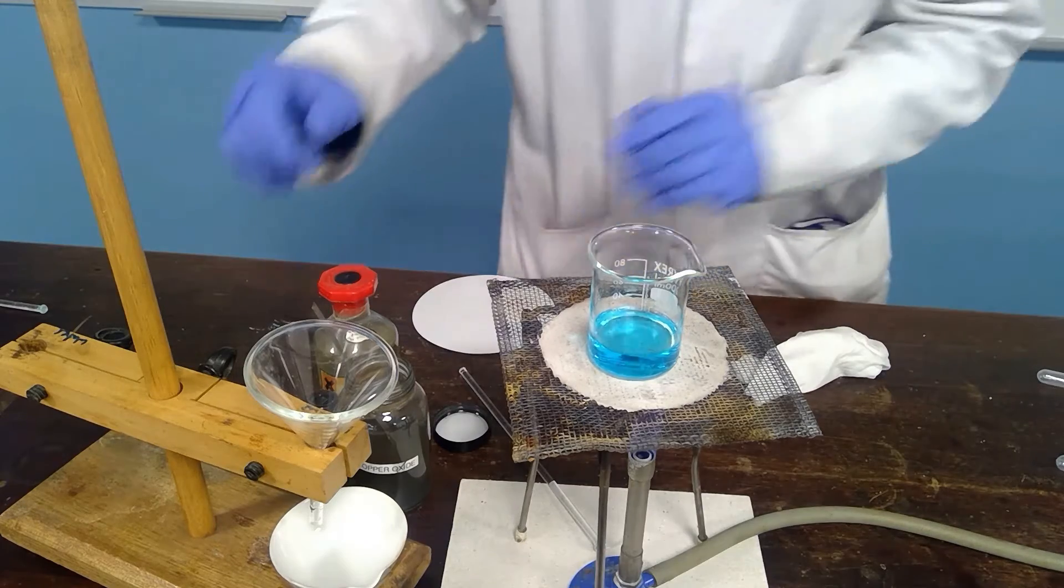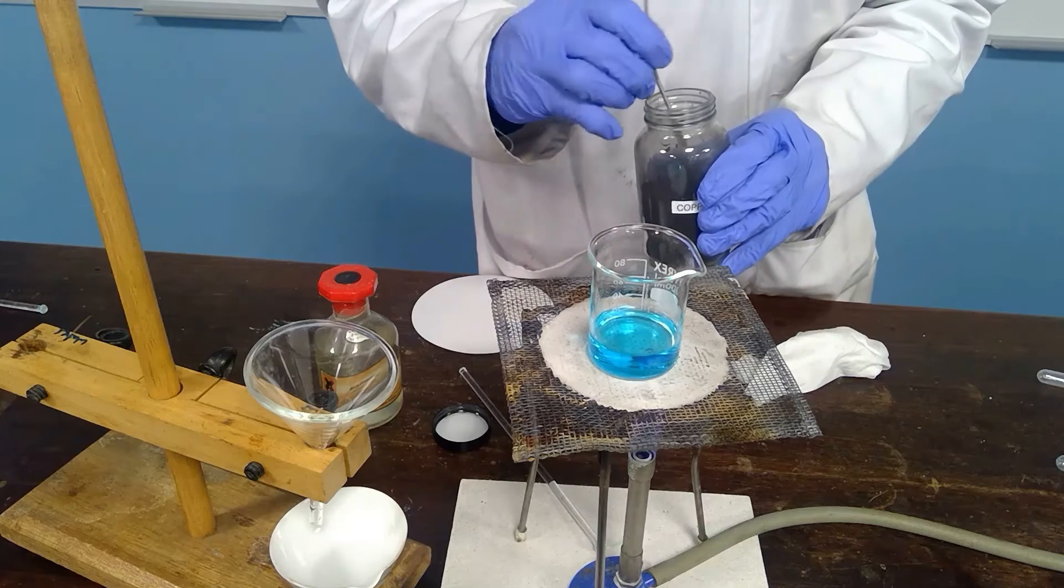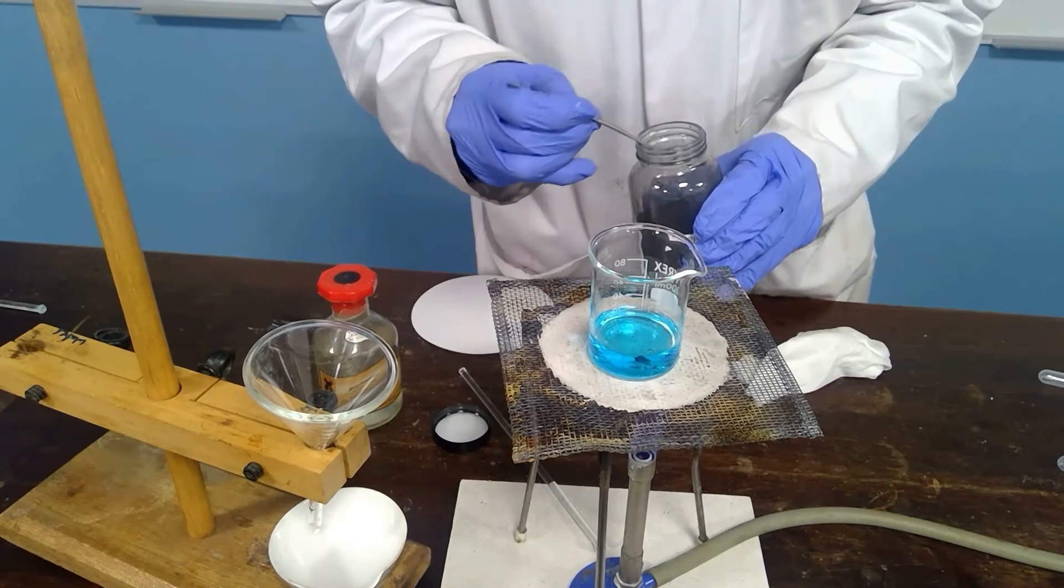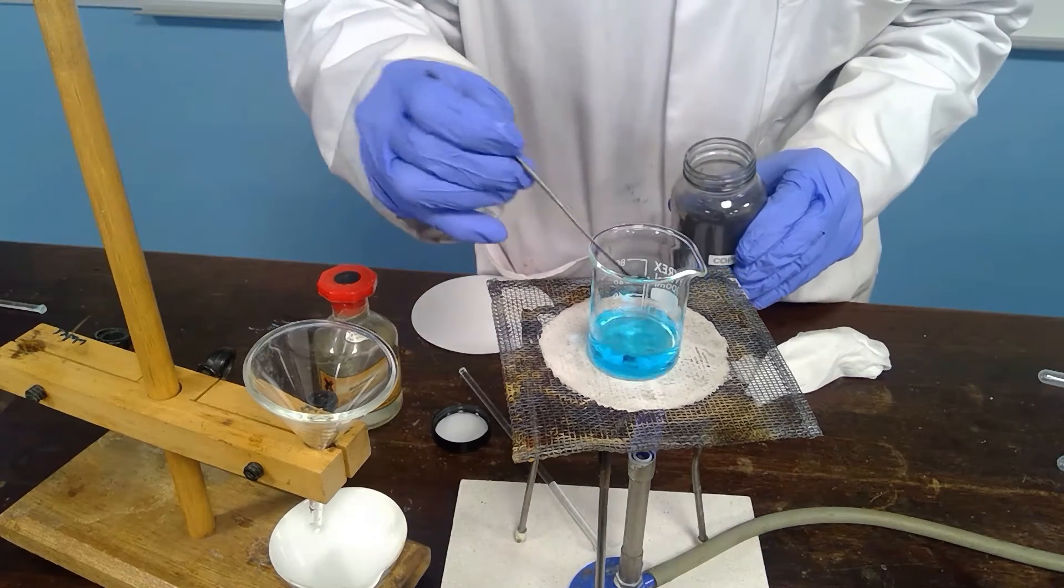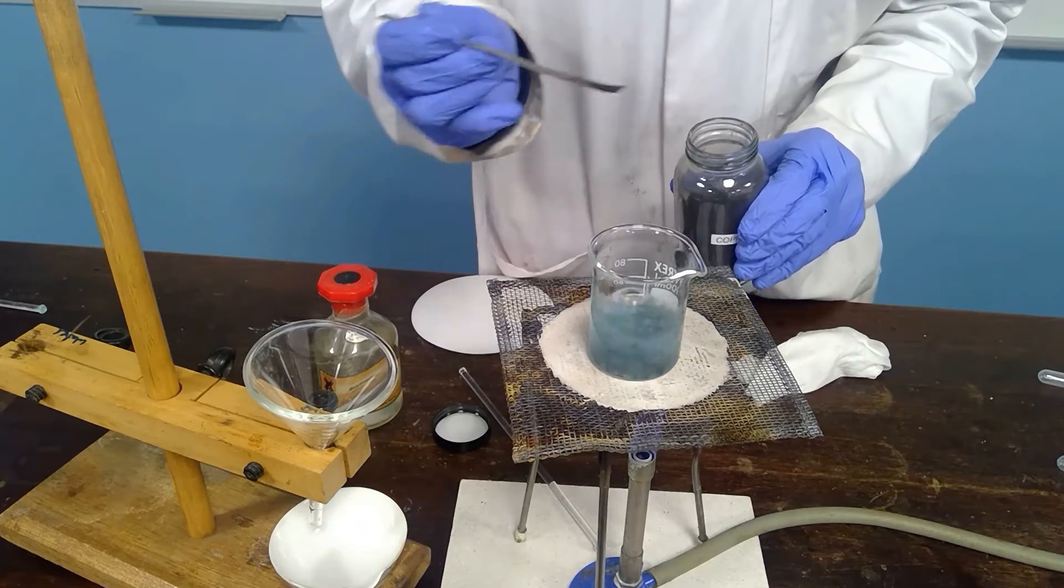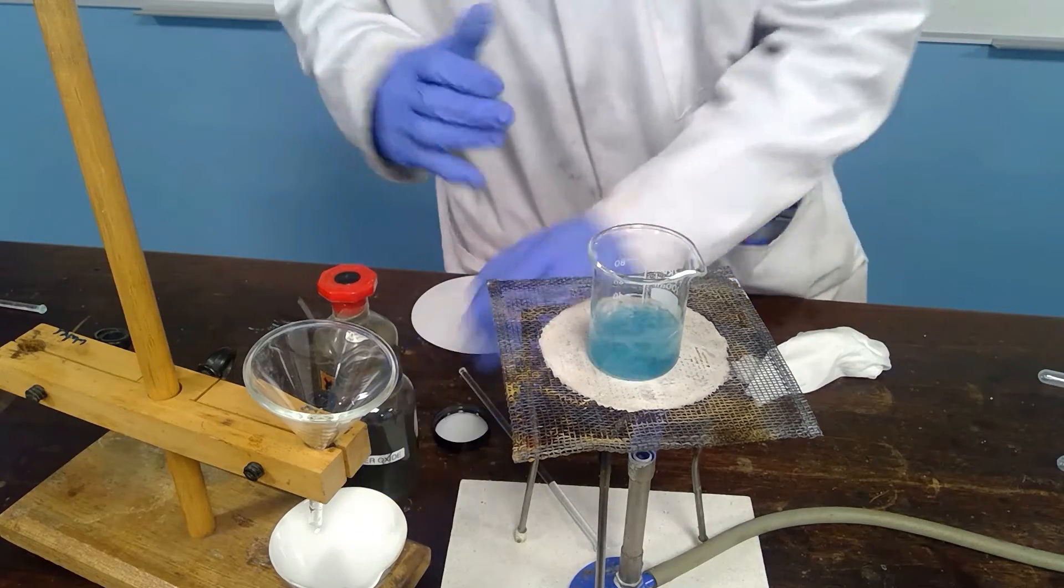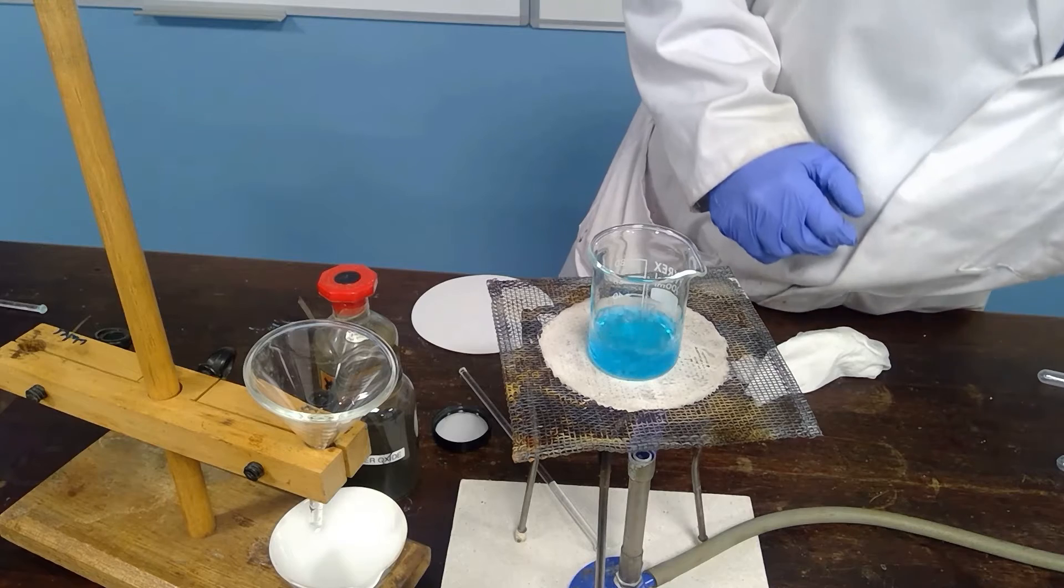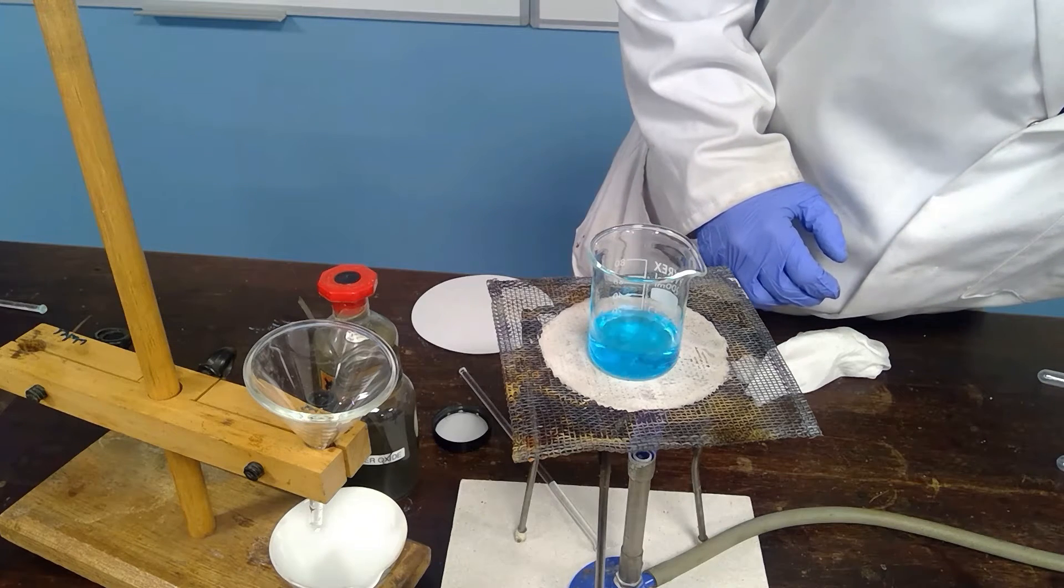So the process of adding the copper oxide is to neutralize the sulfuric acid and to make the copper sulfate. So at this point the reaction is almost instantaneous at this temperature so we will just turn the heating down a little bit more.